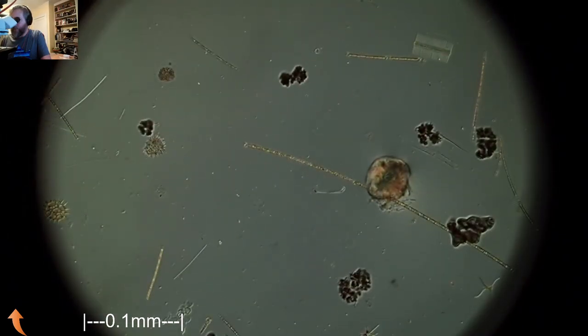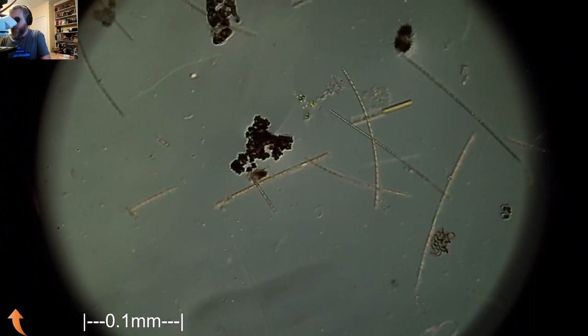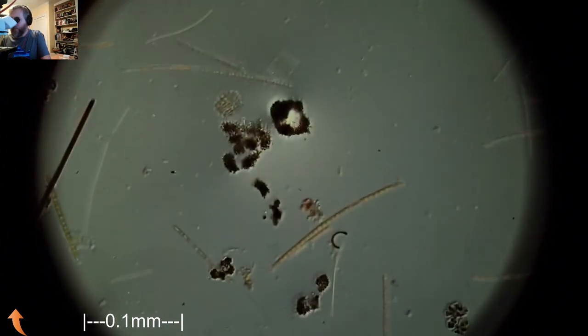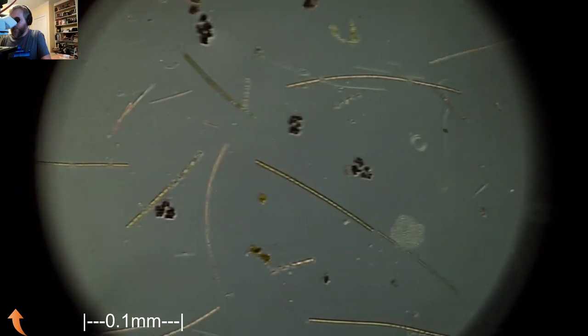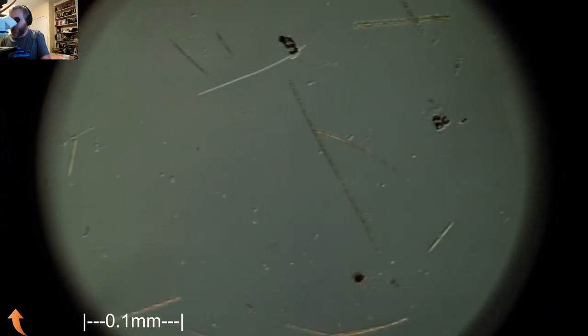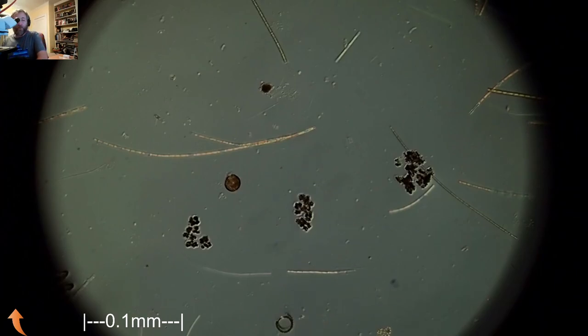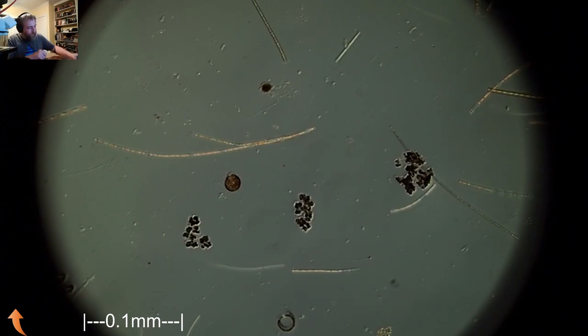And, you know, so it was as far away from the edge as I could get, really. And, I mean, it's still pretty shallow. I think it was only like a meter, maybe a little less than a meter deep. So we couldn't really get way out onto the water. We didn't have time to rent a boat or a canoe or go kayaking out into the water to collect a sample. But we could have if we had a little bit more time. You have to run soon. Yeah. Your stream is starting very soon, Pacific. So I'm going to just make one more slide. I've got a bit of duckweed. And I kind of want to look through that sample and see what's in it, if anything.